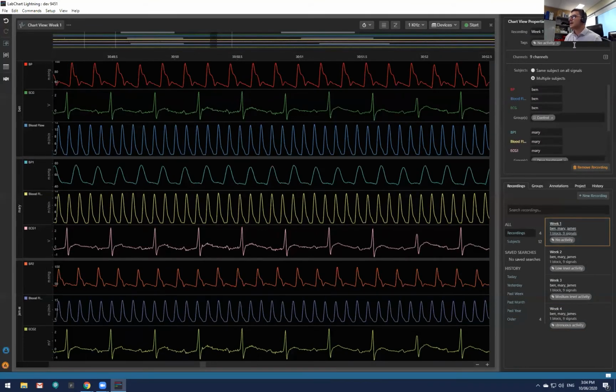Here you have the options, like I said, to add tags, which is really important when you're looking at your work. These are animal studies. You can have the title of your experiment, but if you want to be more specific, you may have a lab book to write your specifics, like the mouse or animal coding, what type of experiment you're doing, or if there were any artifacts or issues, feeding or anything like that. Then you can add tags to help you. This is really important, I think, especially when you're looking at your data after you finish.